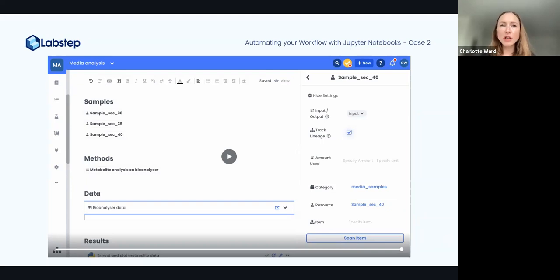With regard to running your own custom packages, I'm not completely sure. I think we'll have to check up on that one. Get in touch with us, Noah, and let us know which ones you're particularly interested in, and we can try this out and find out if it's possible.